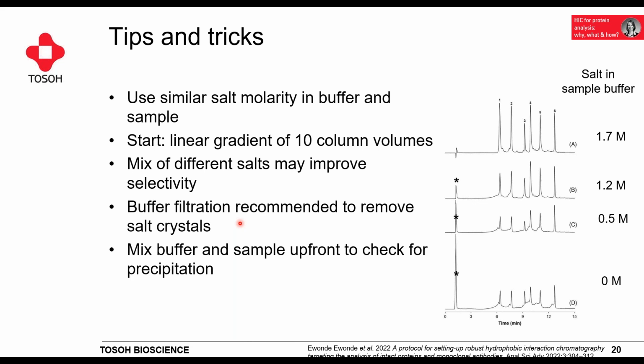Also, always when working with high salt concentrations, it does make sense to, before running it for the first time, mix your sample once with the buffer for binding, or buffer A, just because it might happen that your protein precipitates in the high salt. And this should not happen, of course, in your HPLC instrument, but outside of it. If something like that happens, again, choosing another salt or reducing the salt concentration could be something that might help you.